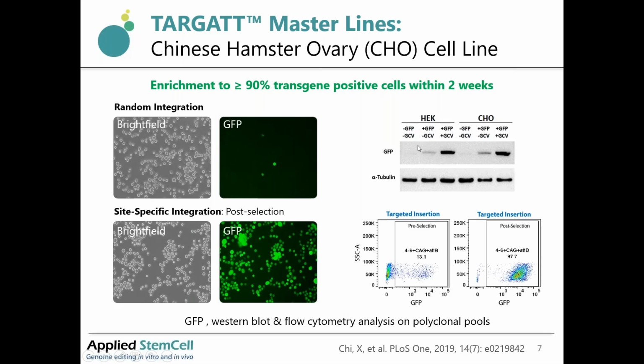Also, Western blot was used to confirm the GFP protein expression, which expressed well and got enriched after GCV selection.